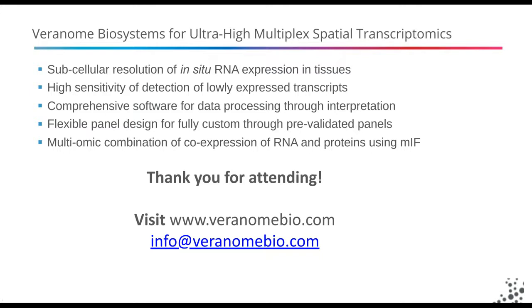Yes, we do. We've generated, analyzed, and validated probably over 50 cell type specific markers. The validation has been done using examination of cellular and spatial expression patterns and by analyzing their performance in clustering experiments.